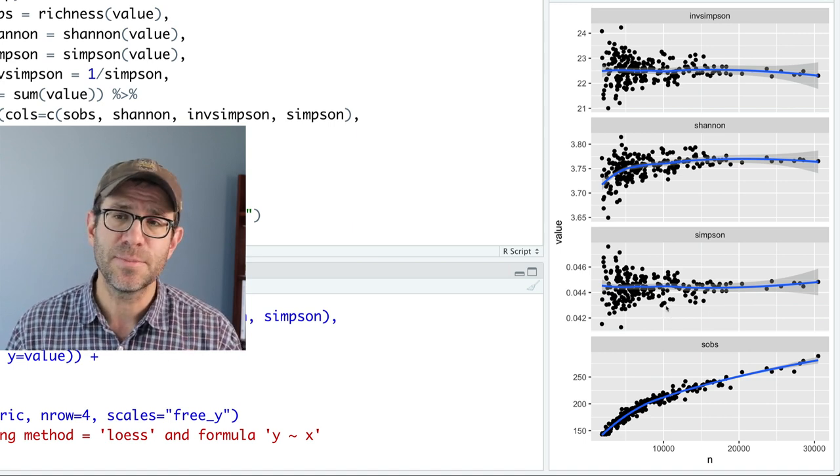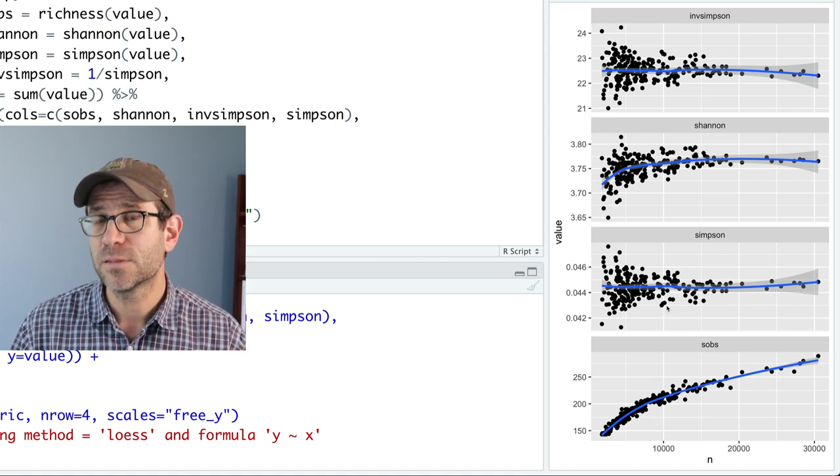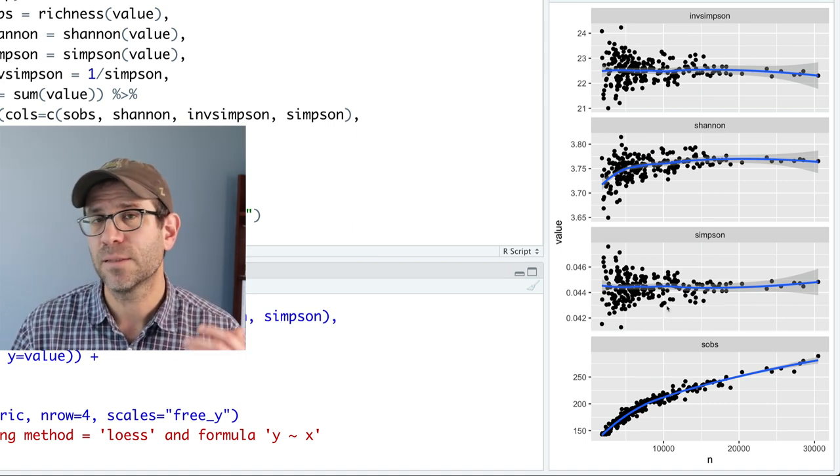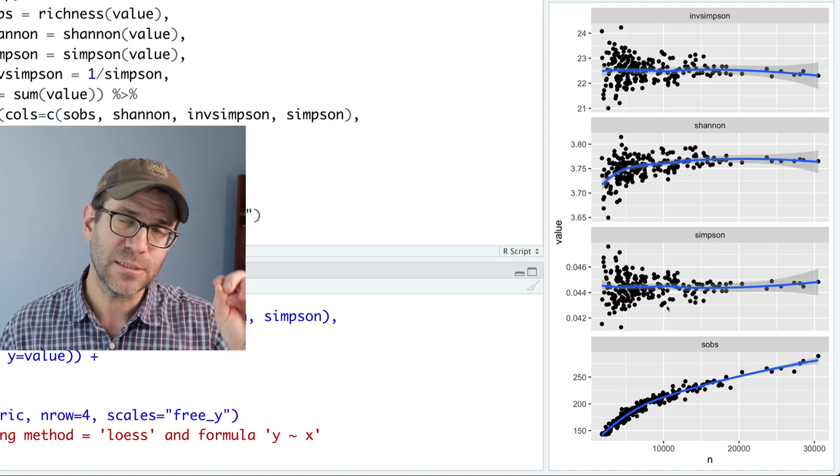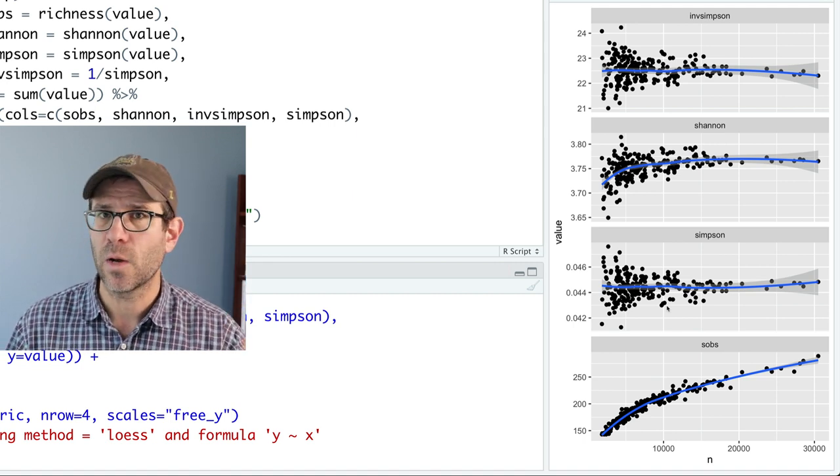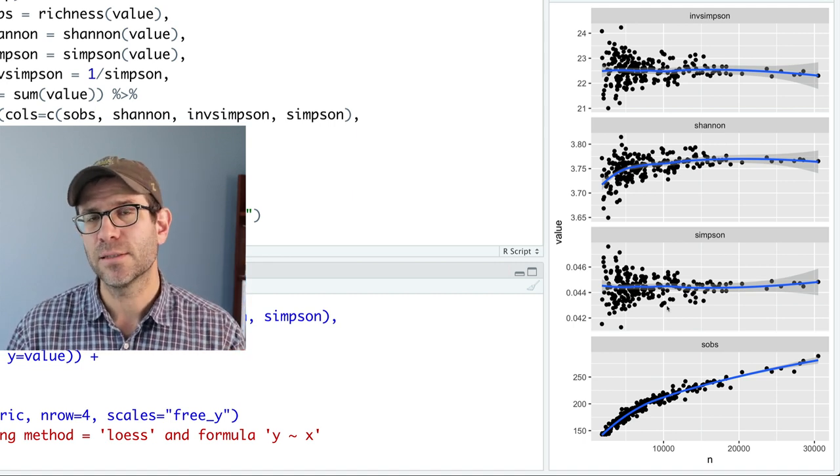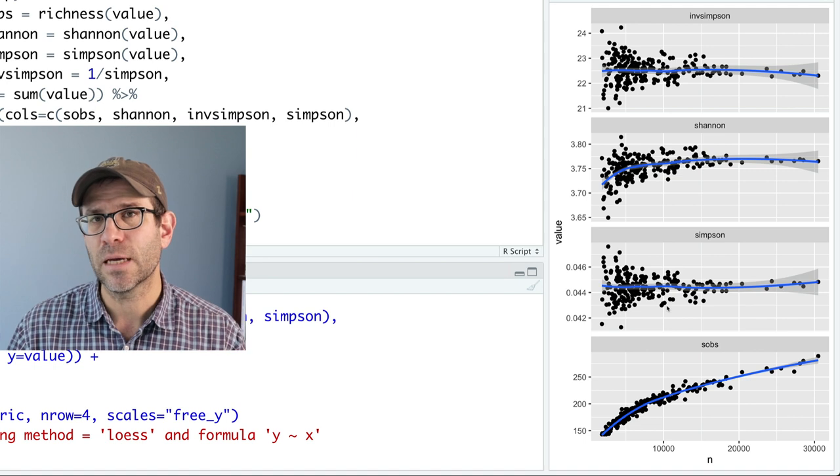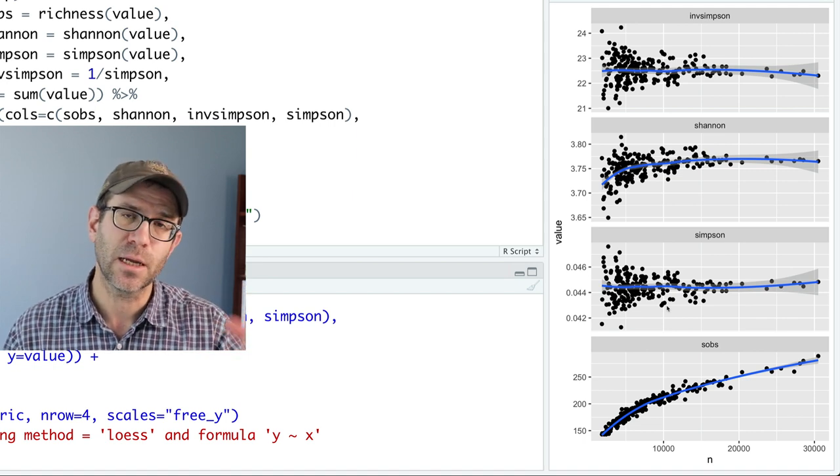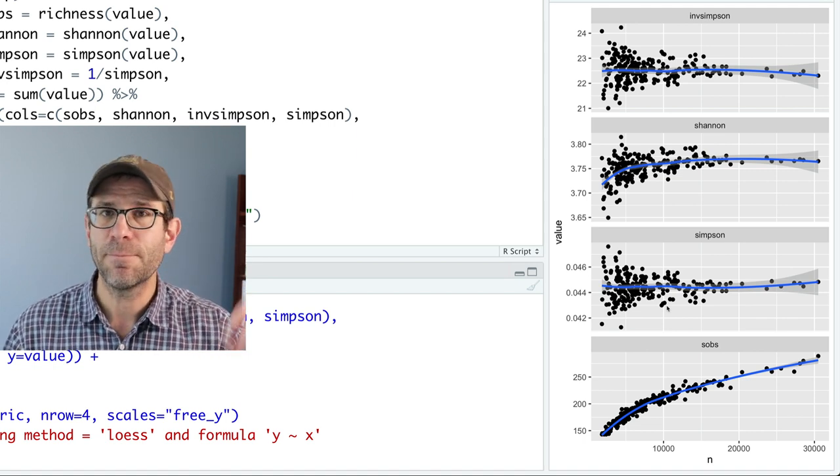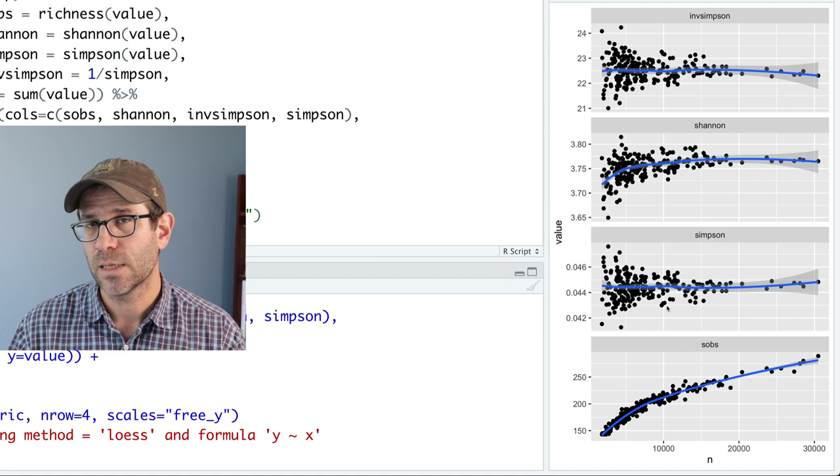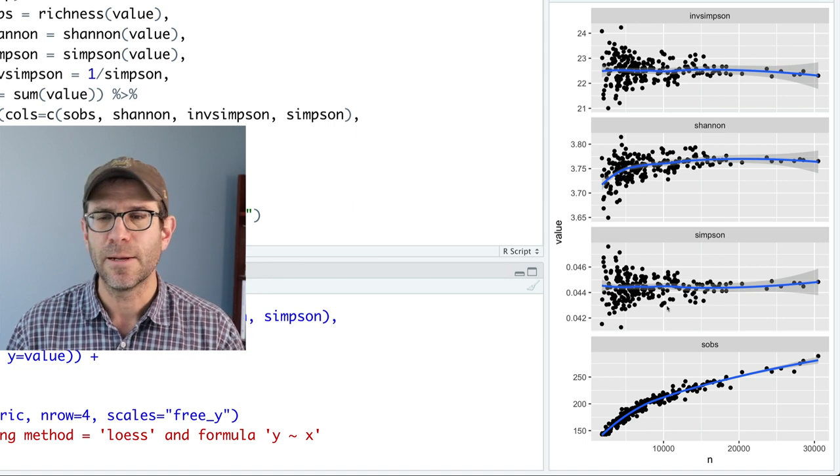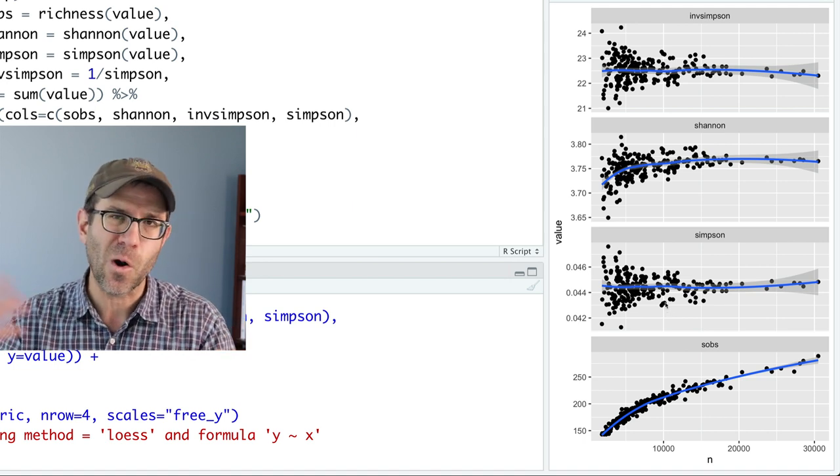One of the reasons that the Simpson and inverse Simpson might not be so impacted by sampling effort is because you're basically squaring the relative abundance. And so what that does is really emphasize the calculation of the metric to be driven by the most abundant organisms in the community.